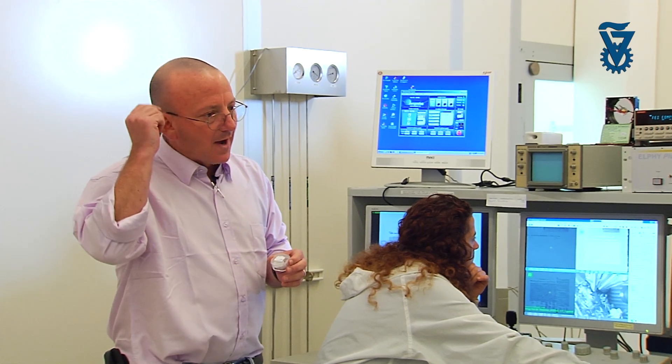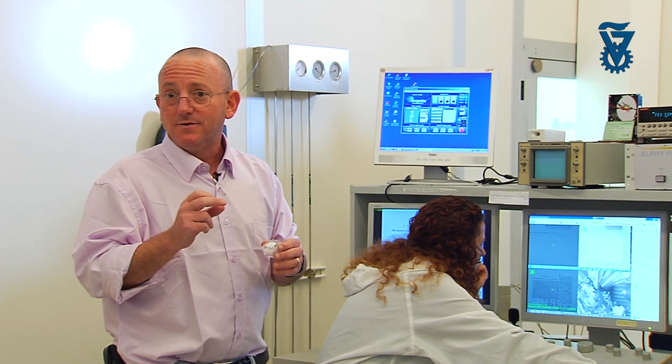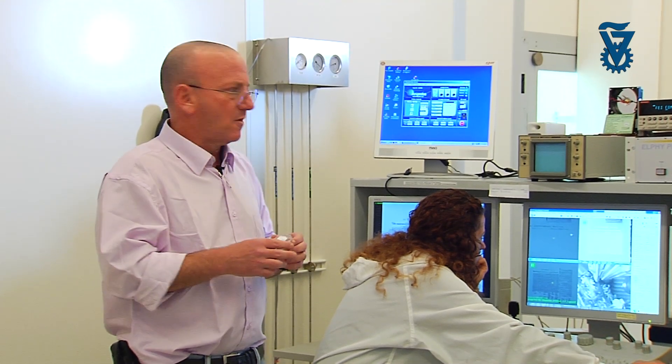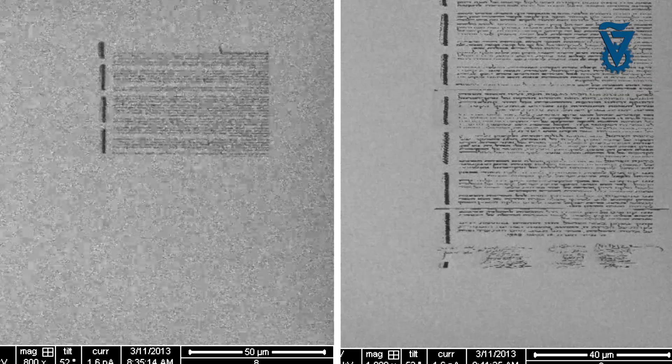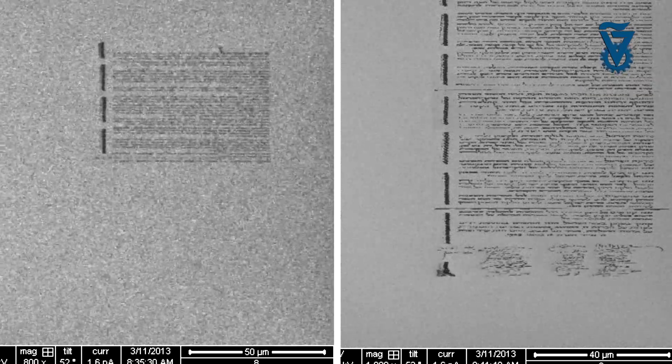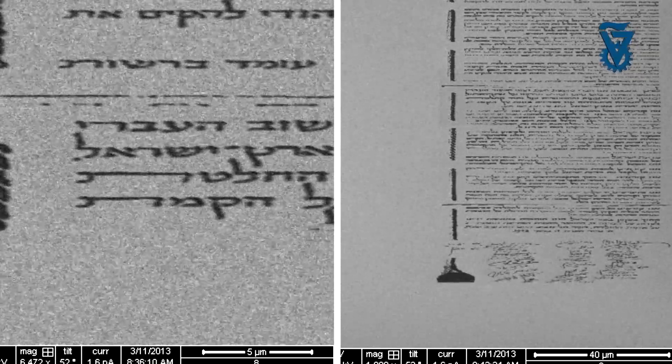Our hair diameter is about 80 microns, so the entire region where we've written this is about a little over two diameters of human hair across. That's not the size of the letters — the letters are of course much, much smaller than that, at about a quarter of a micron. What you see is Dr. Cohen doing this process, where we are taking the written text in electronic form and actually using that to control the position of the ion beam.